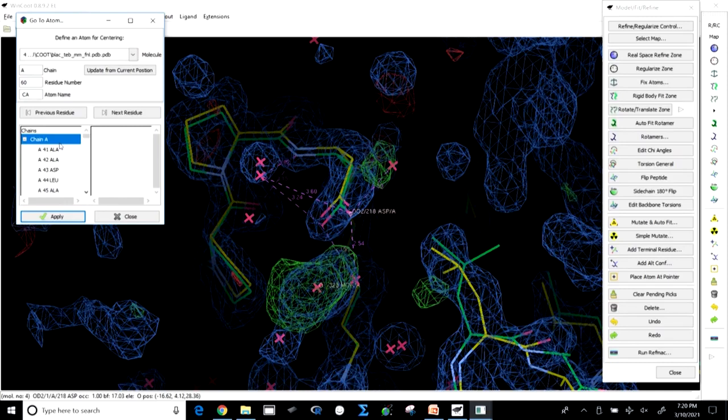If you remember, I always talked about a thing that the initial residues of the protein are generally not an integrated part of the structure. So, that is why they are loose and they do not provide good diffraction.